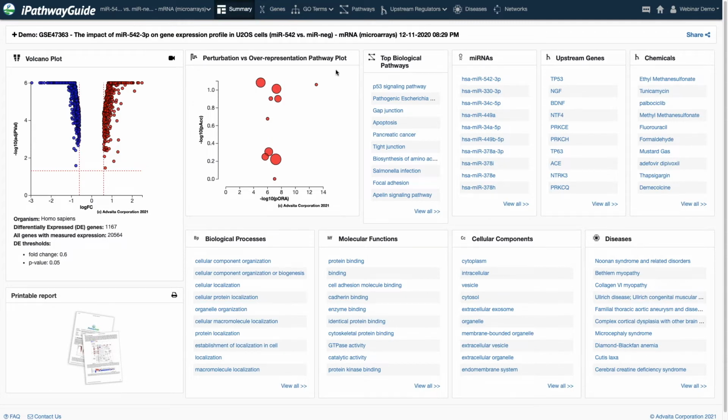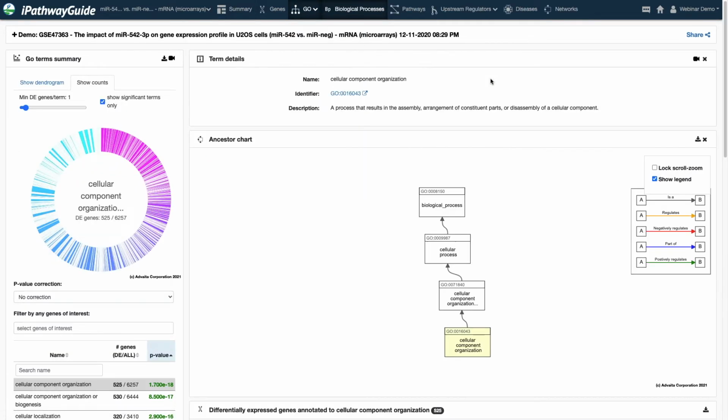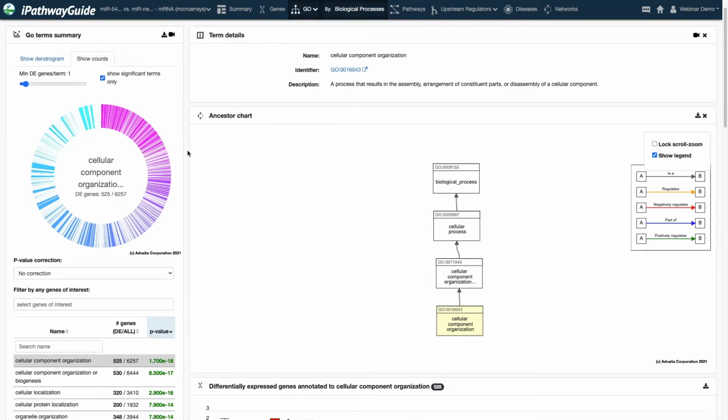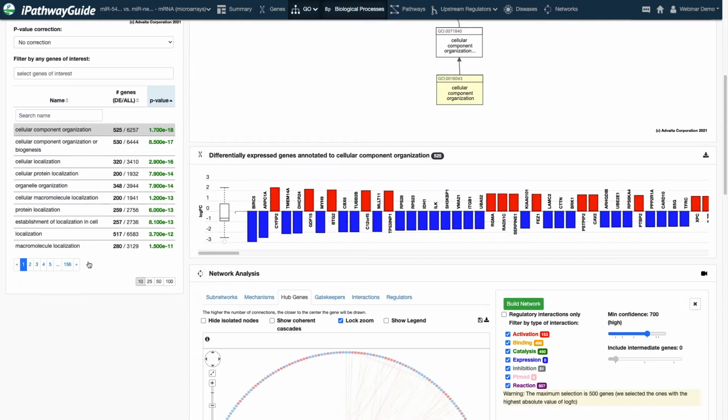Okay, so let's look at gene ontology terms. We covered this a little bit last week, but I want to take a deeper dive and talk a little bit about why gene ontology can be tricky. So if you look here, what we have with the standard gene ontology result is 156 pages, so 1,560 significant results. And if you just start going down the list one by one, you're going to be here forever, first of all. And you're going to see that the top results are repetitive.